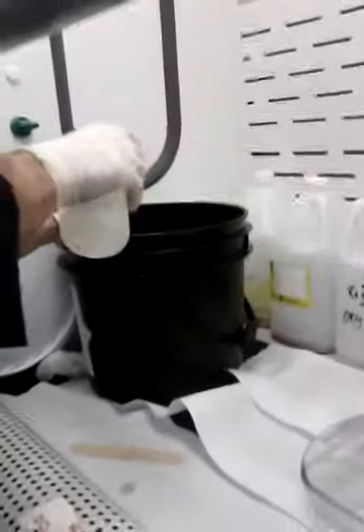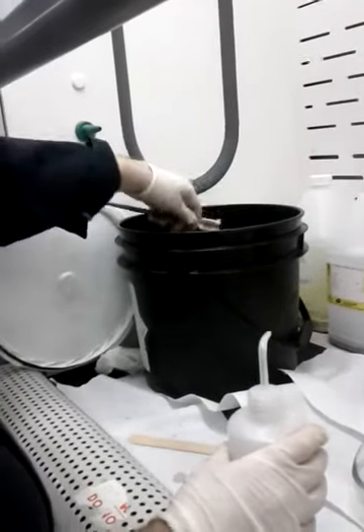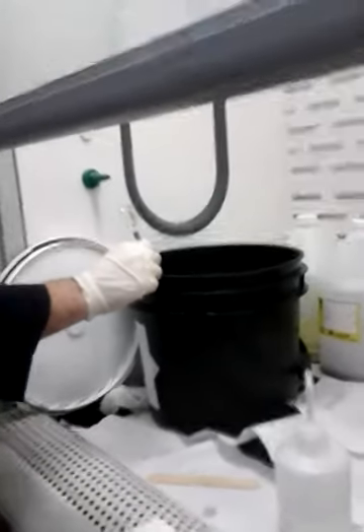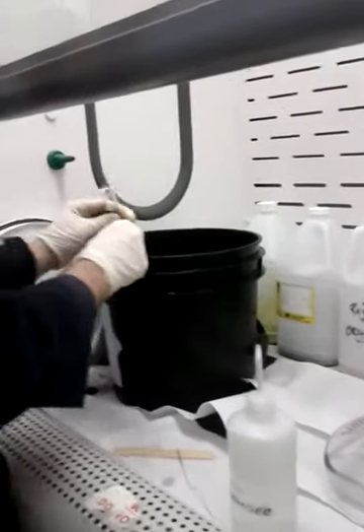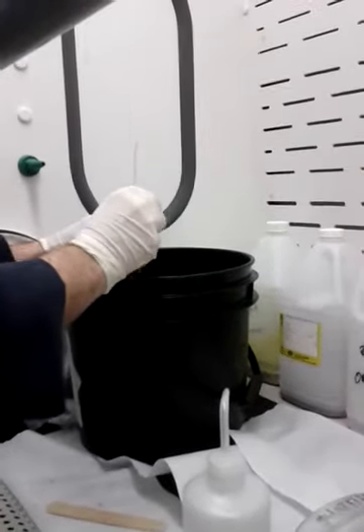After this we have to clean the drawing. We use the brush. Anyway, none of these two ways are recyclable. Is this one here recyclable? Yeah. We give it to a company.